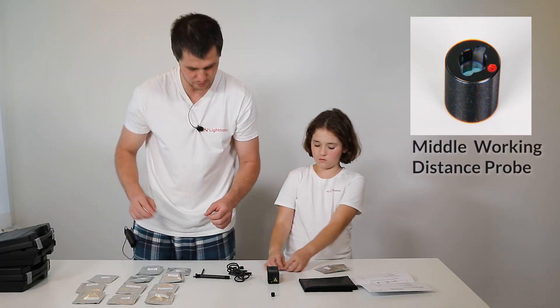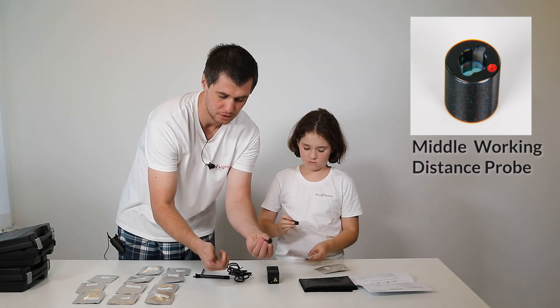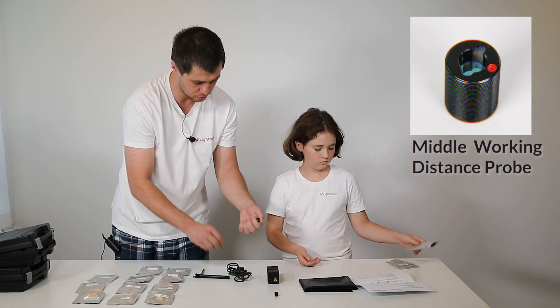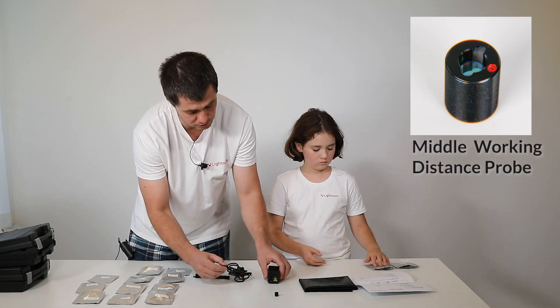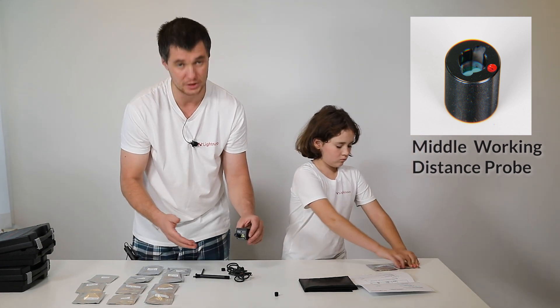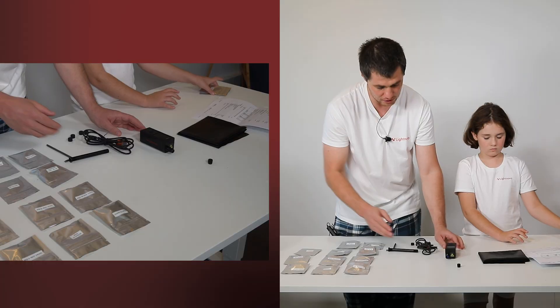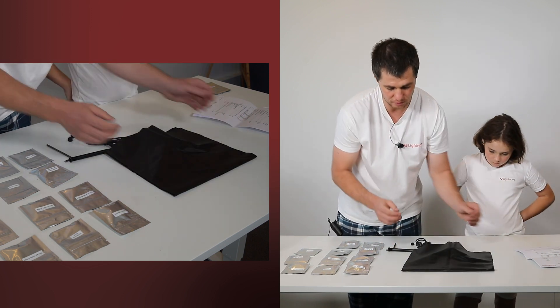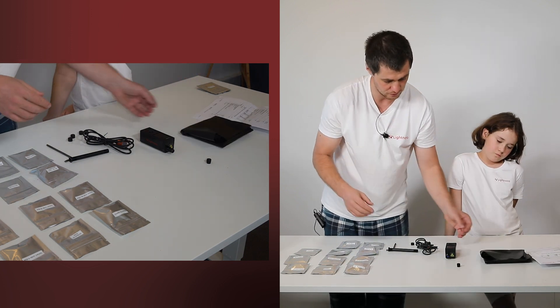Middle working distance probe. By the way, every probe has protection caps to avoid any contamination. Middle working distance probe — we remove the protection caps and it has a red dot so you would not miss it with some other probes. You just do a few screws and it's ready to work. And if you have a sample here, that's how you can use our protection cover — you just cover the Miniraman and you can do measurements being protected from outside environment.